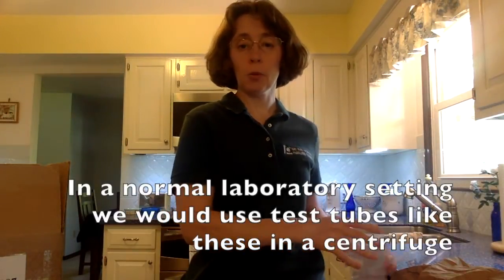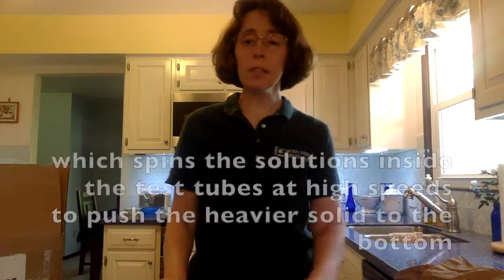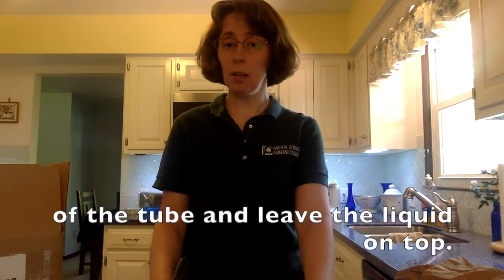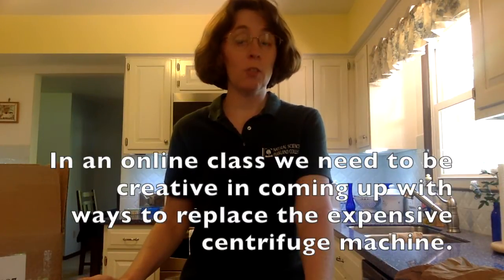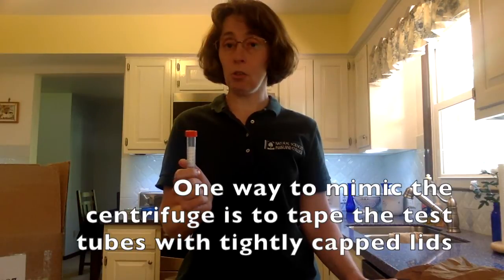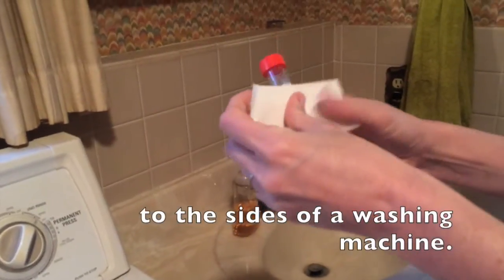In a normal laboratory setting, we would use test tubes like these and a centrifuge which spins the solutions inside the test tube at high speeds to push the heavier solid to the bottom of the tube and leave the liquid on top. In an online class, we need to be creative in coming up with ways to replace the expensive centrifuge machine. One way to mimic the centrifuge is to tape the test tubes with tightly capped lids to the sides of a washing machine.